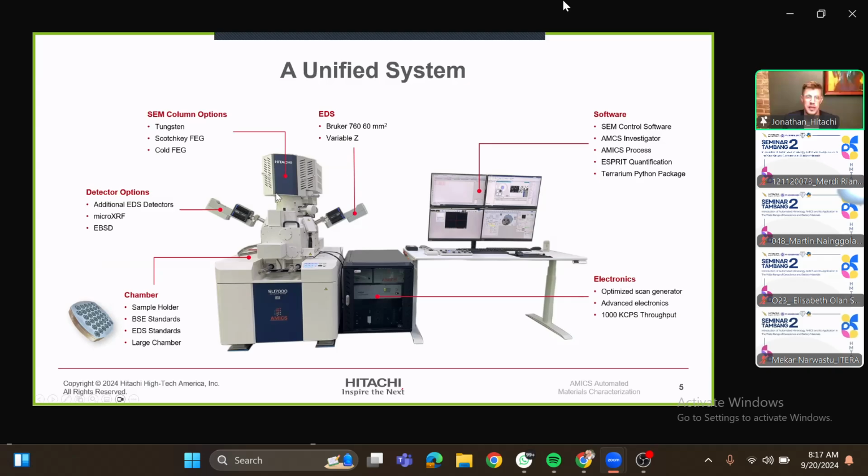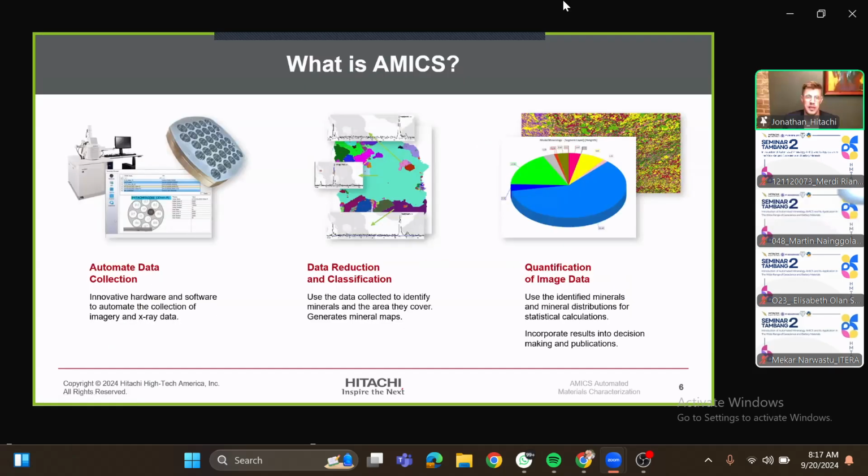These are detectors that generate the spectra. There's another detector inside of it. There's special electronics and a big... So these things are awesome. They're big pieces of equipment. But what does the data look like that it generates?